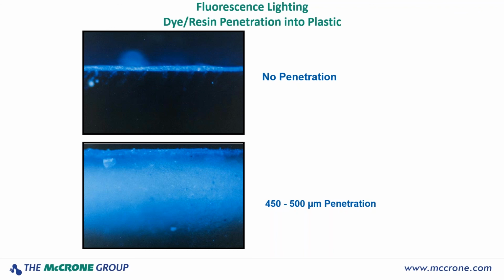In this particular case, it's an automotive paint problem where the paint was failing adhesion very severely, just sheets of the paint coming off. And this was being done when Ford Motor Company was first developing the painting systems for the thermoplastic olefin bumpers and fascia panels that are on cars today. They were having a terrible time with the paint adhering to the thermoplastic olefin.